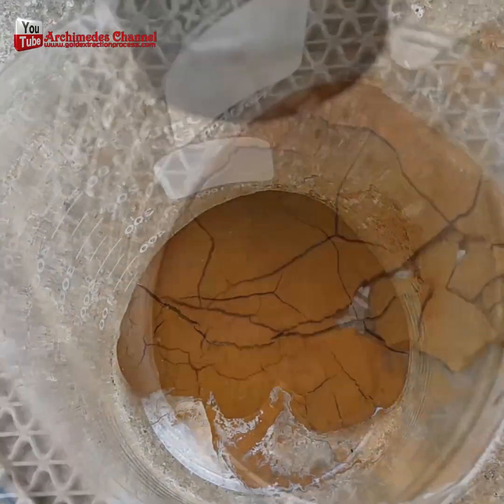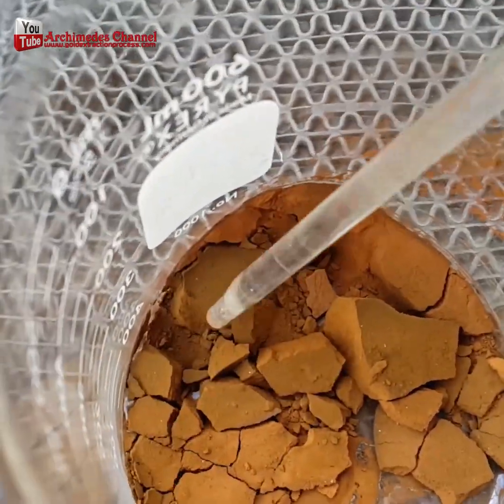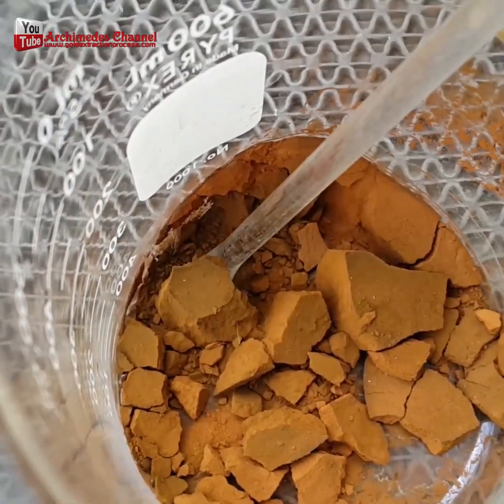Carefully pour it out. Once that's done, dry out the dust that remains. Be careful — that's gold dust.